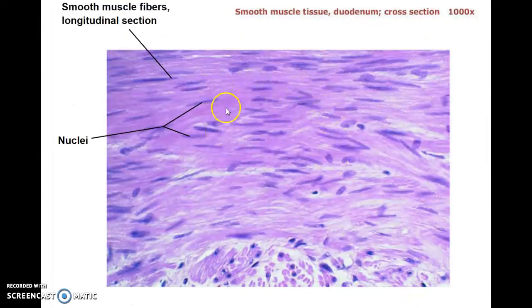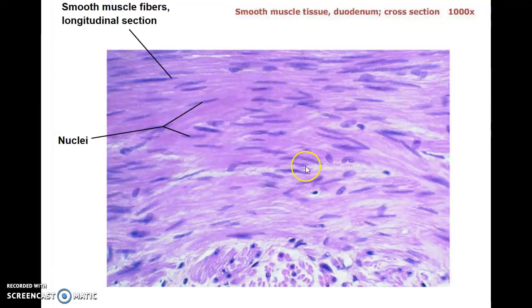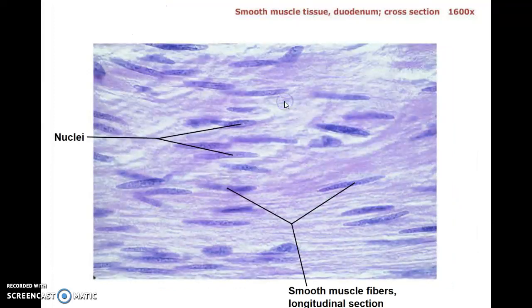The best description I can come up with is they look like a bunch of guppies or fish swimming upriver together. You can clearly see the nuclei; the small cells kind of all jumble together. They have a very different muscular contraction — much slower, without striations — that kind of rhythmic and peristaltic action we think of for smooth muscle cells. Here's a closer view showing the nice single nuclei, again just looking like a bunch of guppies jumbled on top of each other. So that's it for muscle tissue.